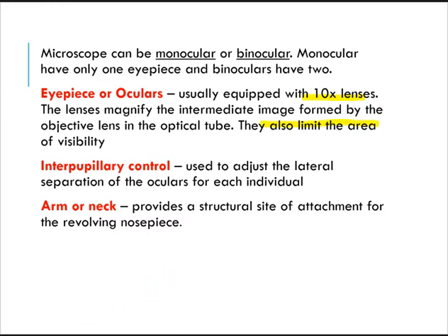Based on my experience in face-to-face classes last year, during medical histology, a few students still didn't know how to focus their microscope comfortably.